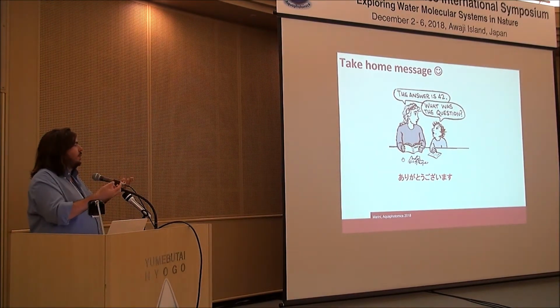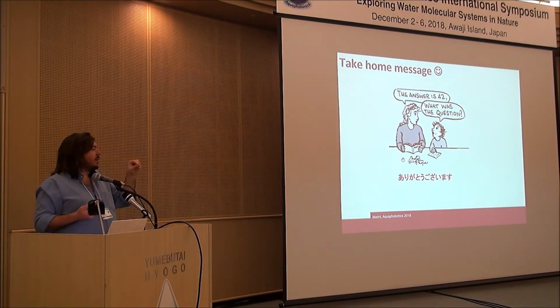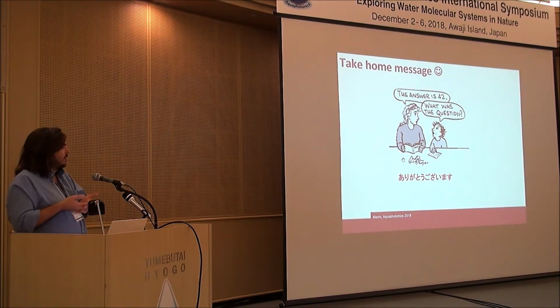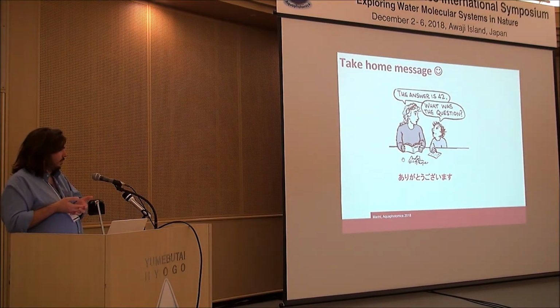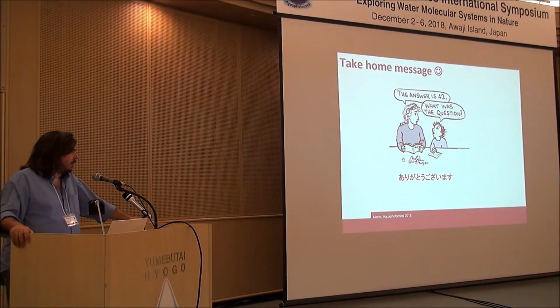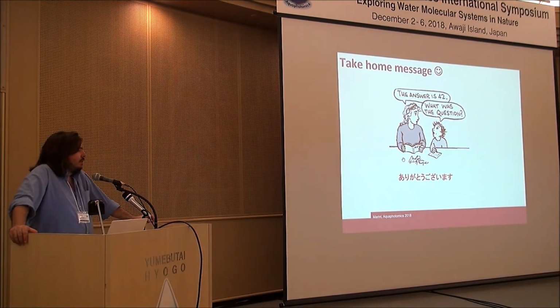Then you will have to look at global interpretation. But you have the tool of having chemically meaningful profiles, so you can check whether the interpretation is consistent. Because we can sometimes find, for instance, that with 2 components and 3 components the interpretation is completely different. Especially between 2 and 3, it may happen that with 2 you don't have enough degrees of freedom to estimate the meaningful variation in the data.